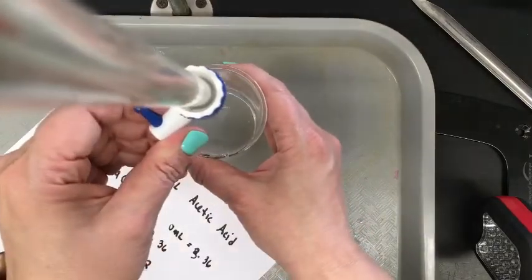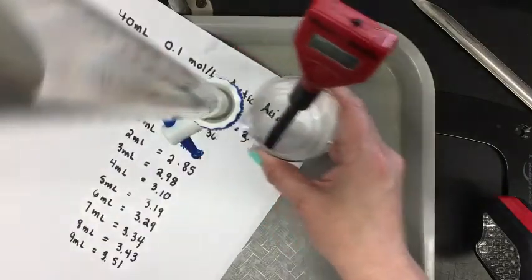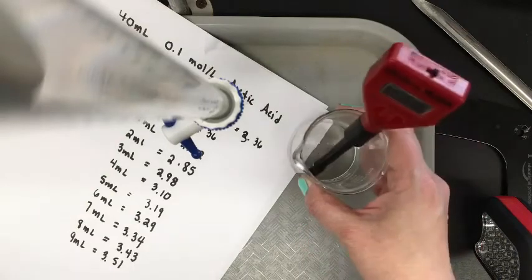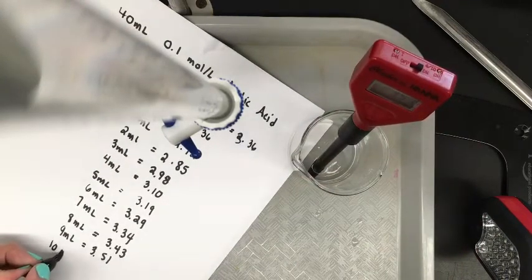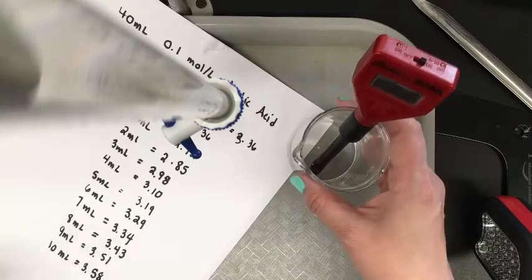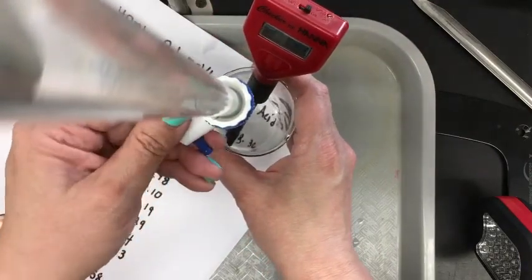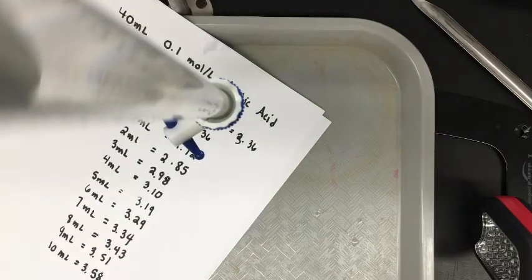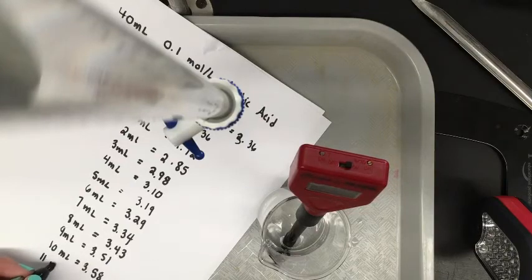Add another. At 10 milliliters, we are at 3.58. I'll add an 11th. There we go. We're at 3.63 at 11.